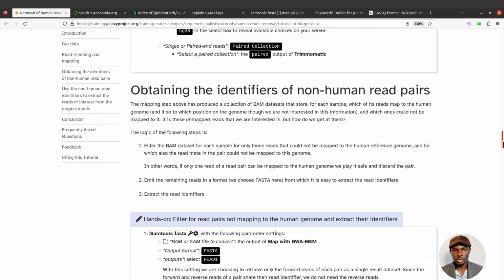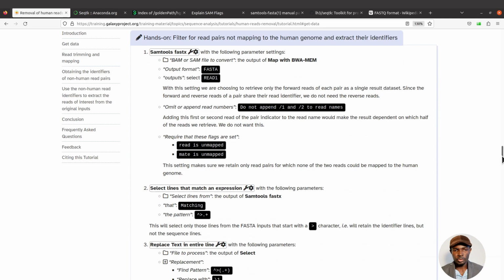So let's proceed. So let's scroll down. For some of the activities, I'll combine them into a single line. That means I'll give you a one-line command that we can use, but I'll explain everything later on. For now, let's take a look at this one here.